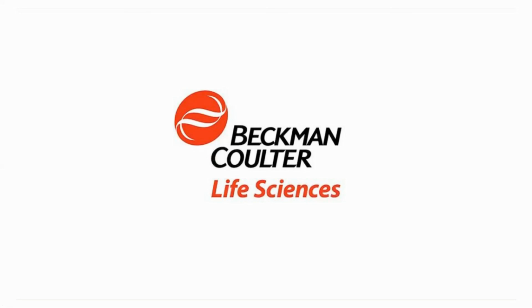We could have racks of tips, plates, and other types of labware, where you would tell a mobile robot how many plates you want to process on each of these systems, and it would pre-fill those systems with those tip boxes and plates ahead of time. Then the user in the morning would come bring their sample plates and fill up any reagents or troughs. So that's something we're thinking about. We haven't moved forward on it yet, but it's one of our ideas.